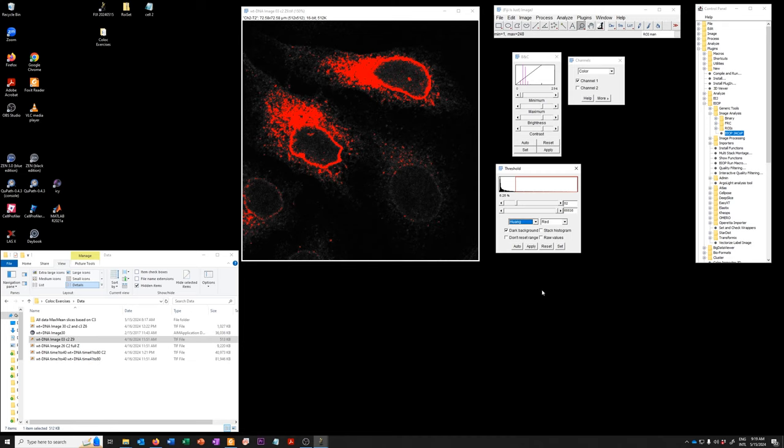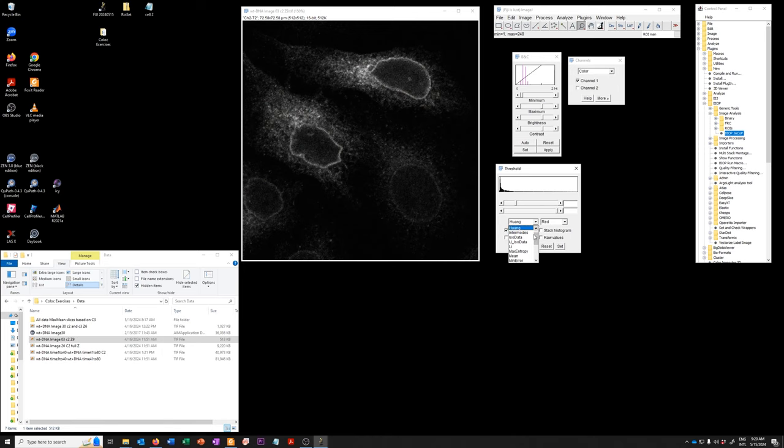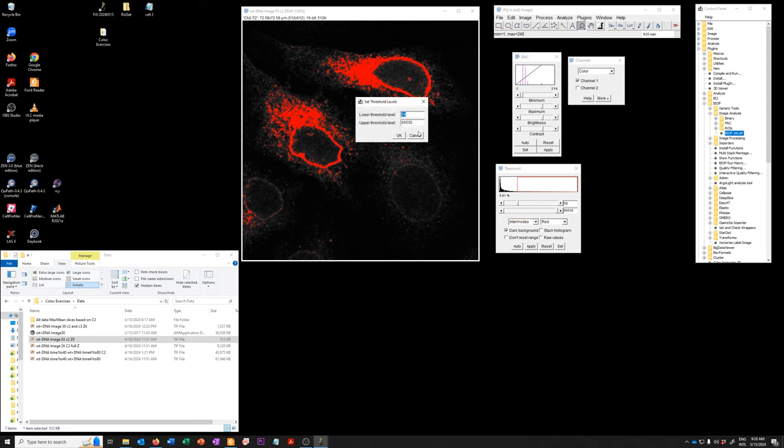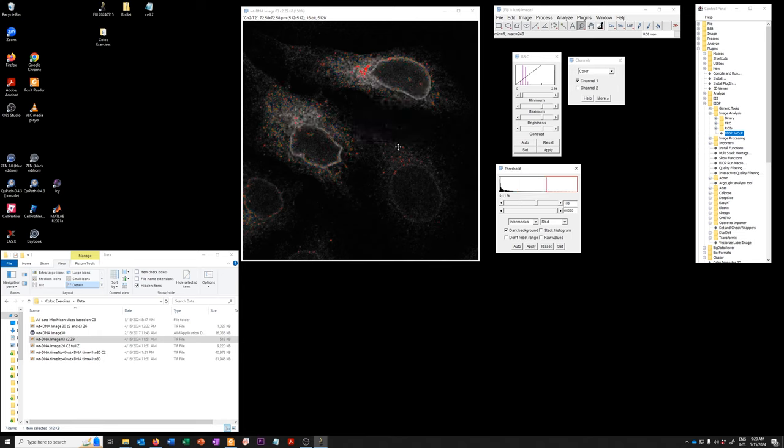If you want to reset and go back to no thresholds on the image you can do that and then you can select whichever option you like. Again you can set up the manual and if you say set you can actually type a value here. So you could say well what if the threshold were 150? So that's what it looks like.